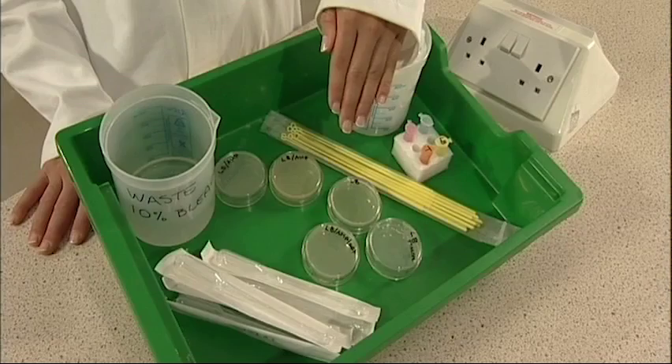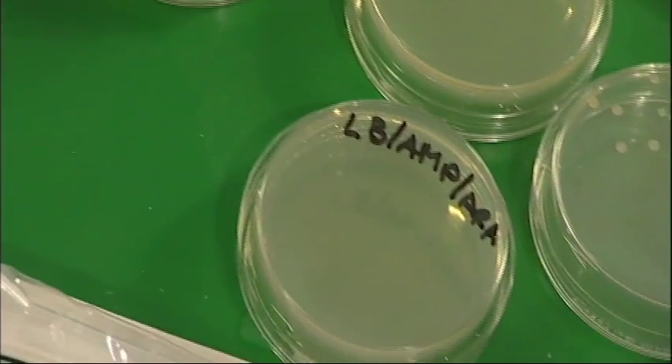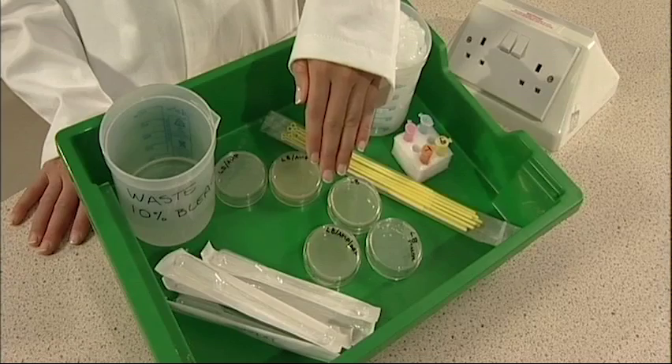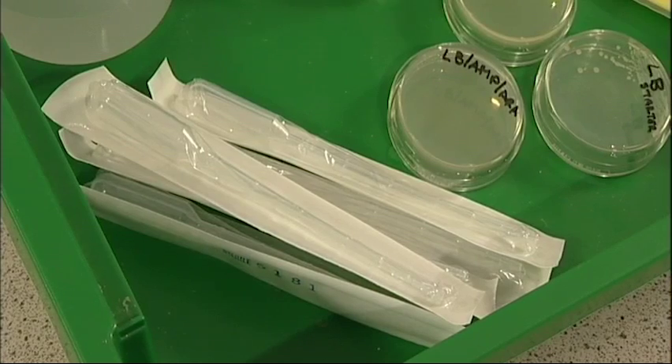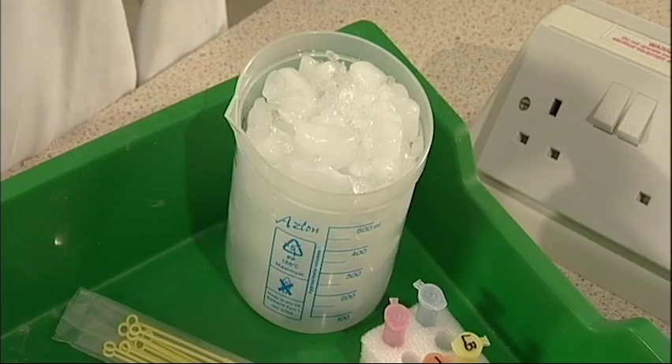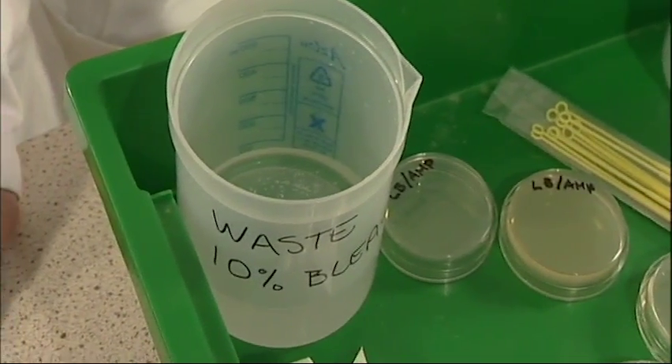Also included are 1 LB plate, 2 LB amp plates, and 1 LB amp ara plate, a bag of sterile inoculation loops, 5 sterile transfer pipettes, a beaker containing ice, and a waste pot containing a 10% bleach solution.